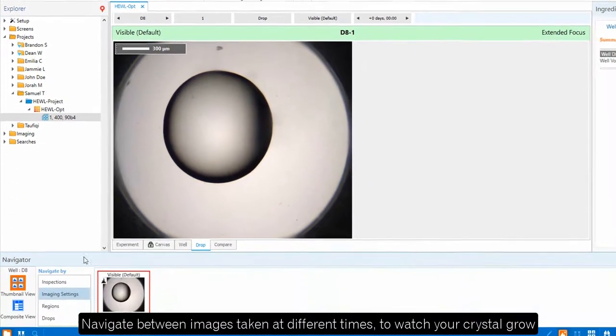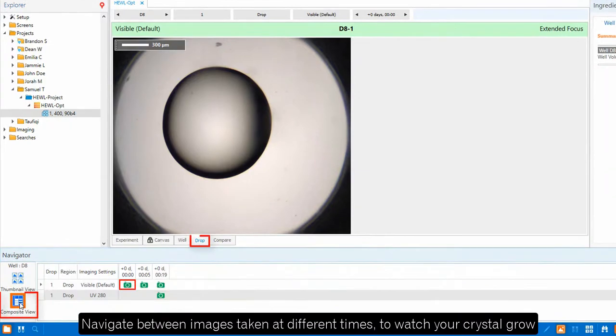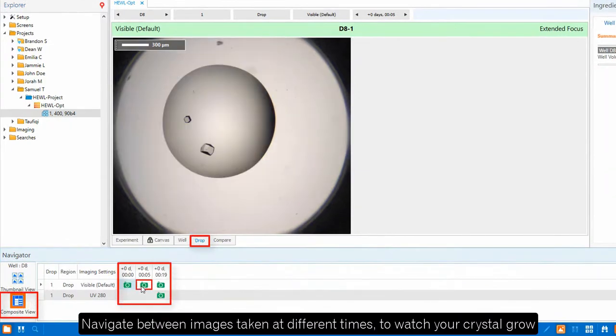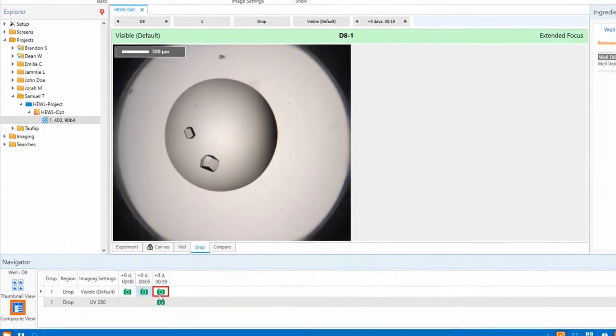You can easily navigate between images taken at different times to watch your crystal grow.